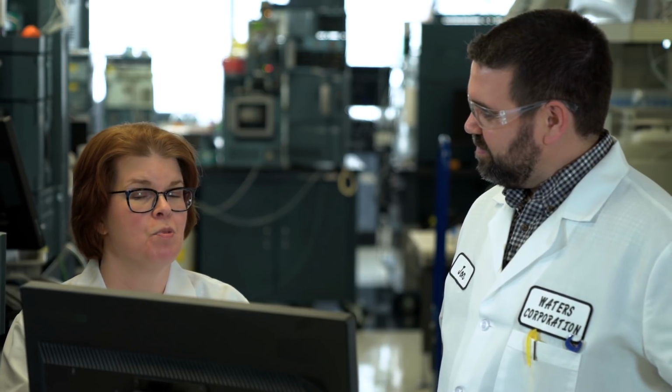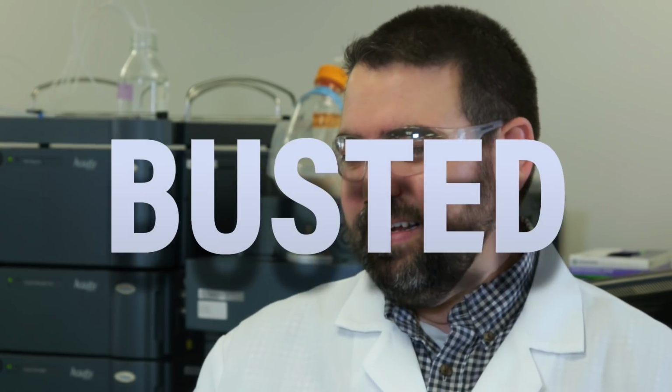That's right. All right, so I think we need to email this customer and let him know that the percent carbon load doesn't really tell him how retentive the column's actually going to be. Yeah, based on percent carbon alone, Kim, this myth is busted. I think it really is. It's hard to track or to correlate overall retentivity with just the carbon. There are other things in play, like I said: pore volume and surface area are all important too.